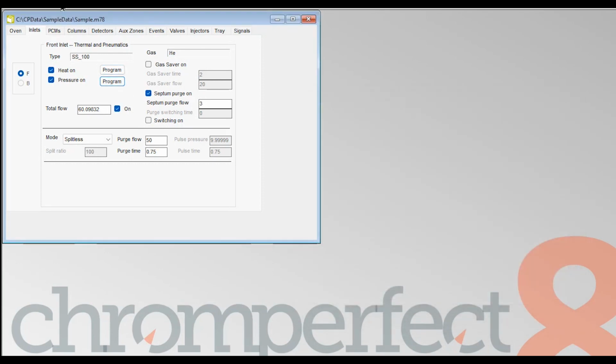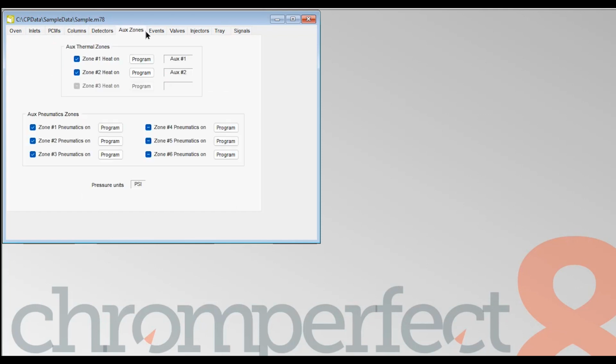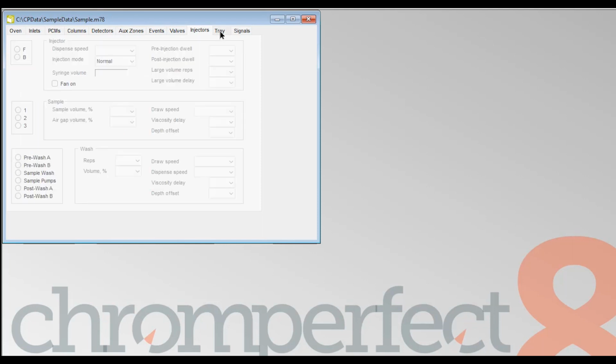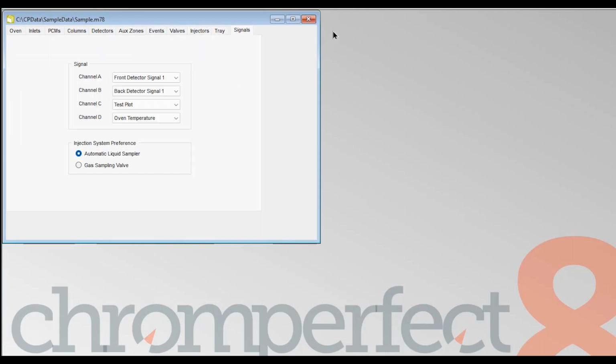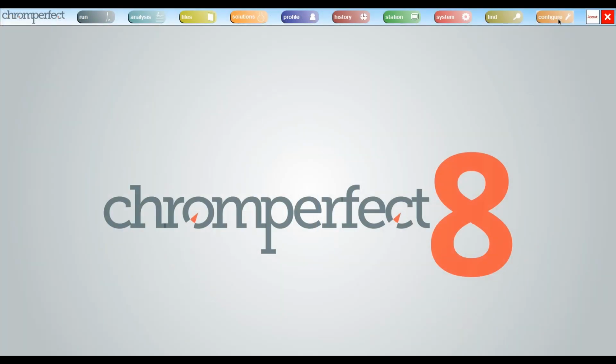Once we have created our first setpoint file from the instrument, Chromperfect will understand the unique instrument fingerprint. We can then edit this file, and save as a different name to create other instrument control setpoint files for other analysis with different run parameters. It is also important to note that it is not good practice to share setpoint files between instruments. The configuration may be different between instruments of the same model. Because of this, using a setpoint file uploaded from another instrument may cause unexpected errors.